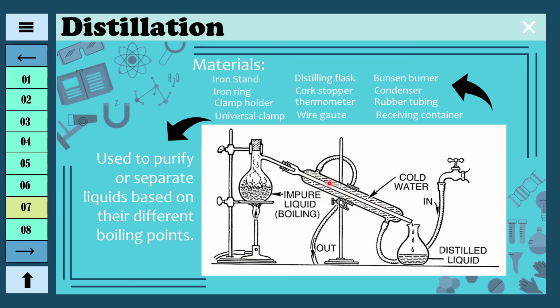Once the gas becomes a liquid, it will be received in the receiving flask or beaker. The resulting product is what we call distillate.